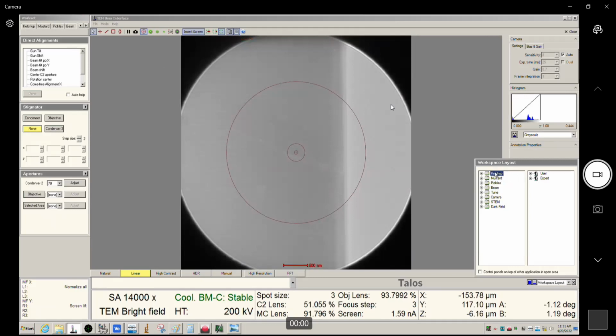If you're the person overseeing the microscope, you could do this. I can't rename these panels, since the panels are fixed to be what they are, but I can control which panels go into which of these tabs. So you might see something else on a different microscope. Thankfully, we have a lot of flexibility with how you set up the user interface here, which is nice. Okay, startup alignment. Oops, actually alignments was what it was.